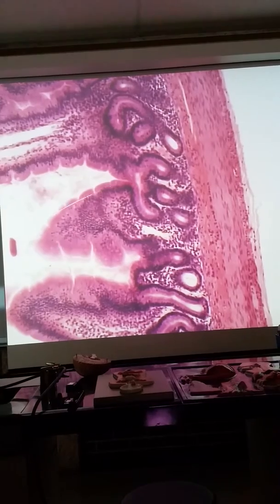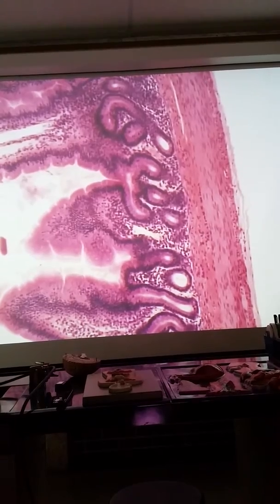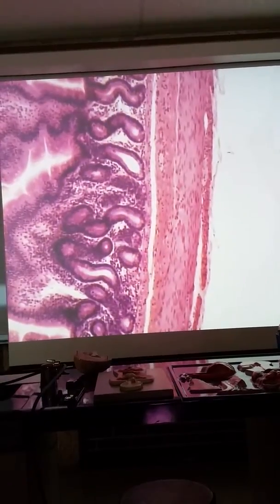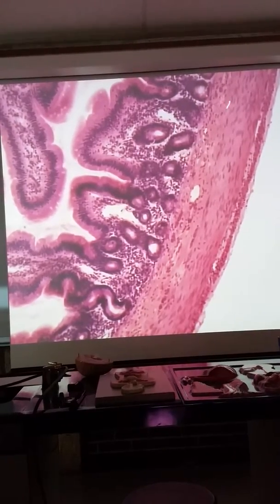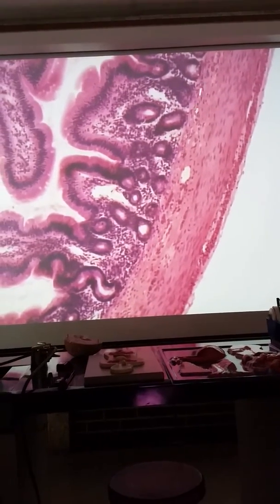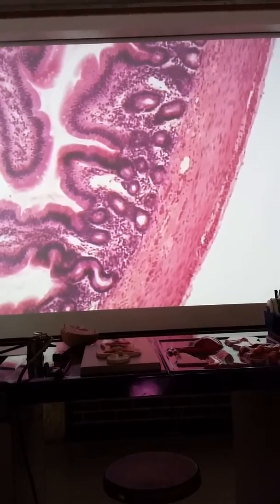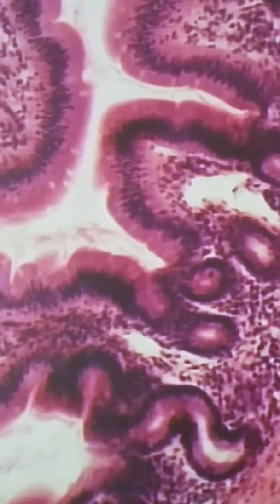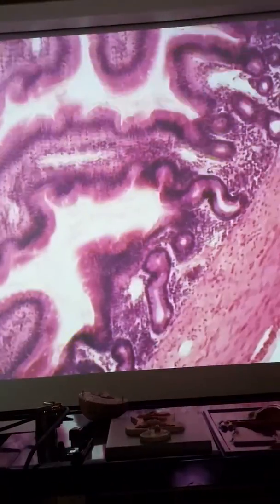You see same tissue layers, mucosa, serosa, muscularis, and then the submucosa. Get a better spot here. Well, I'll go right along through here for submucosa. Now, see those little white dots? Those are our goblet cells. And lacteals. Move this around. There's kind of one.